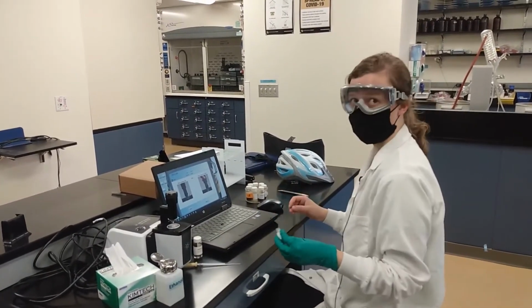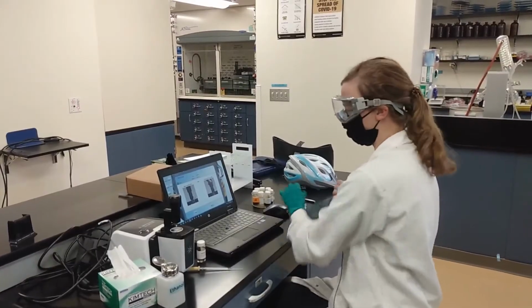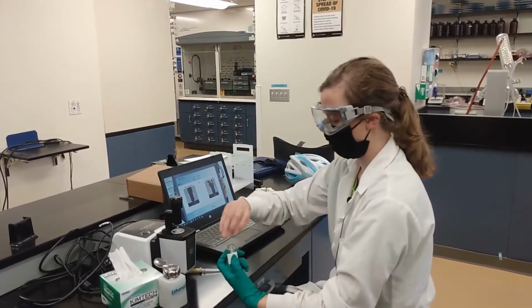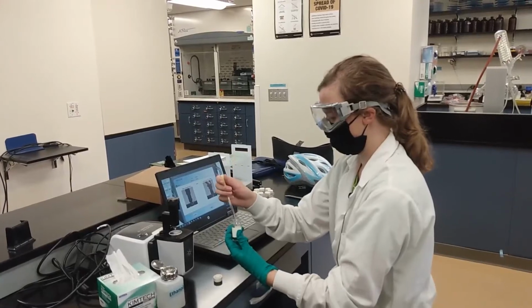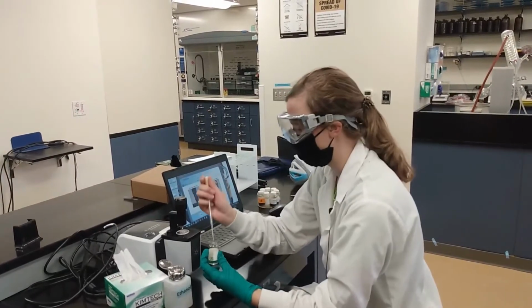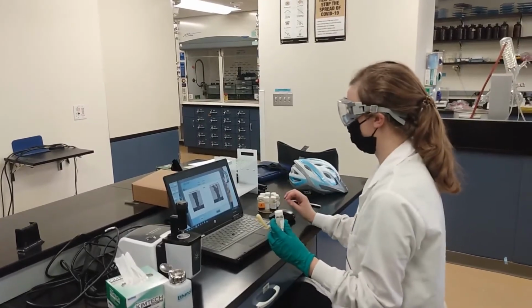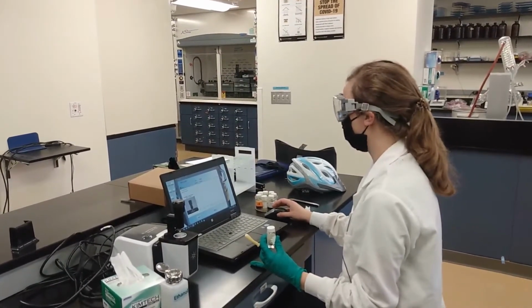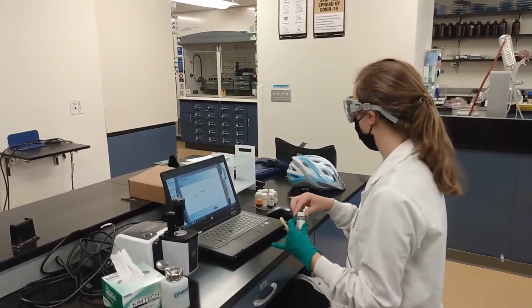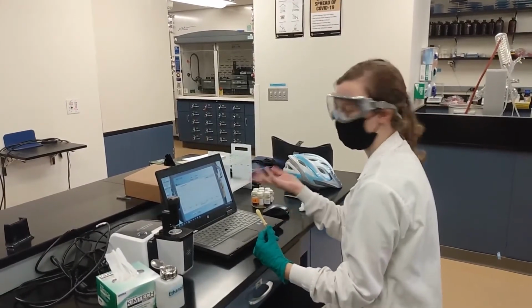Perfect, okay. So it has a background measurement taken. If there's any gunk that's left on our crystal, it's going to subtract that out of our final sample. All right, so now, using our gloved hand, we're going to open up our liquid sample, pull up a little bit, and just put on enough to cover the diamond, just like that. We're going to go to next, and it's going to start running the sample in real time, but it's not saving that data. So we're going to go to next again, and then it's going to start actually taking our sample measurement. And we're going to end up with something that looks like this.